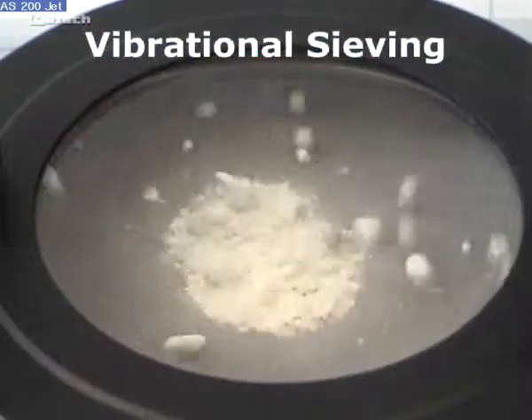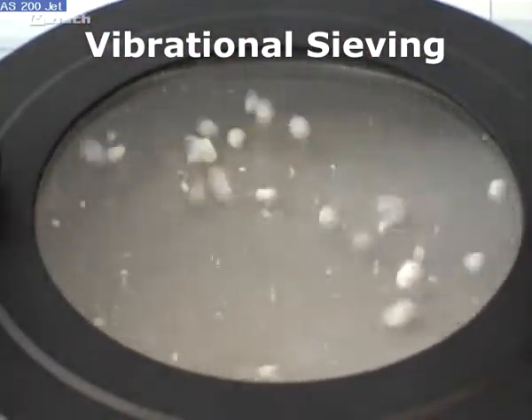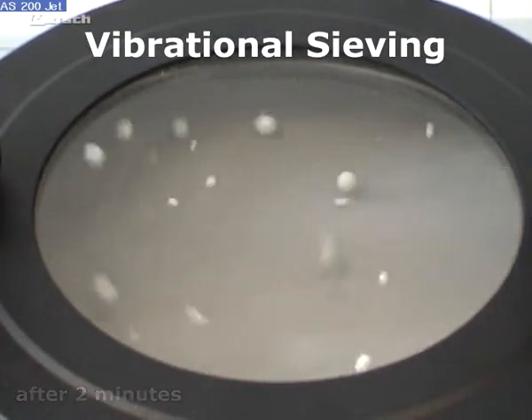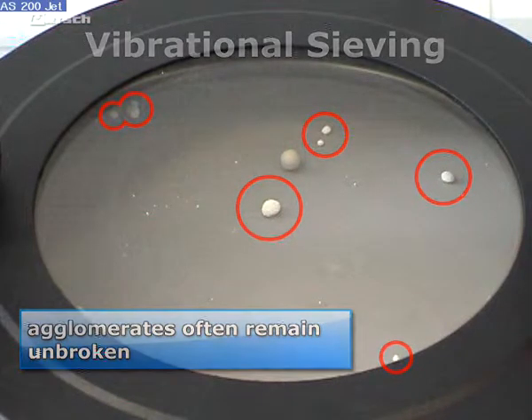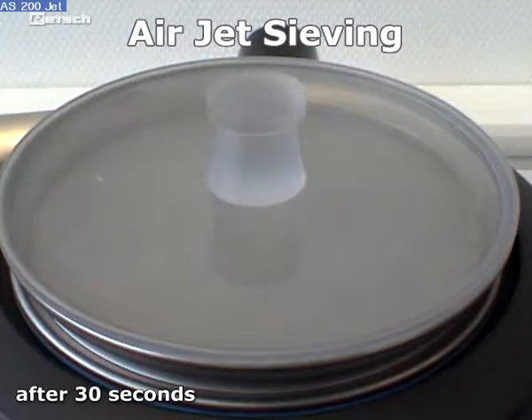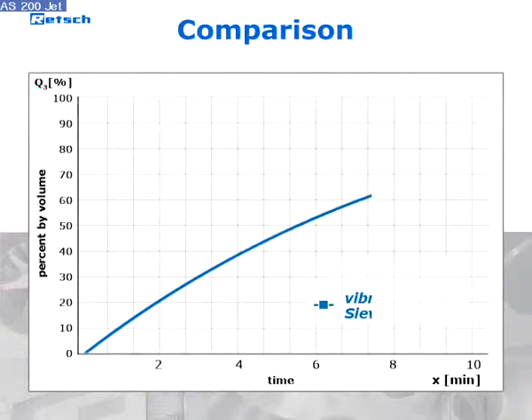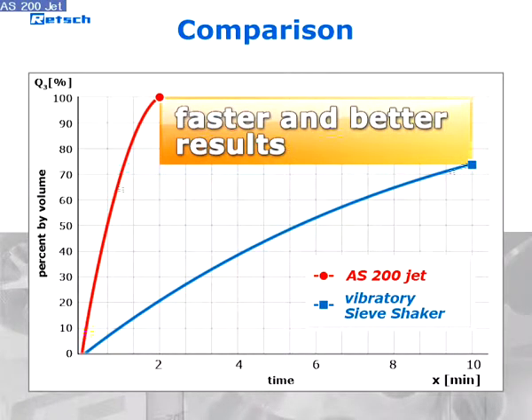Vibrational sieving of sensitive or very light sample materials with a tendency to agglomerate, which primarily applies to particles smaller than 200 microns, is very difficult. It is definitely problematic for particle sizes below 63 microns. In this size range, air-jet sieving is the perfect solution. Compared to vibratory sieve shakers, the AS200 Jet provides for fine materials sieving results with a higher degree of separation efficiency in only a fraction of the time.